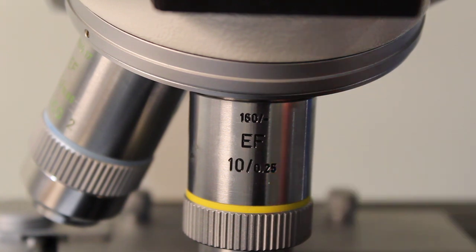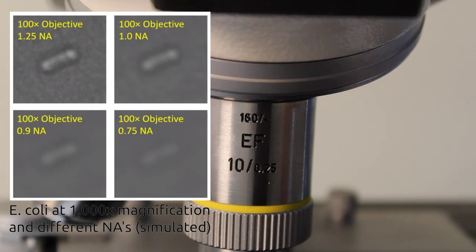The second number is this number beside it the 0.25. This is the numerical aperture or NA and this is what determines the resolution of the lens. It sounds weird but the NA is actually more important than the magnification because the NA is what determines how small of an object you can see and also the amount of contrast in your image.